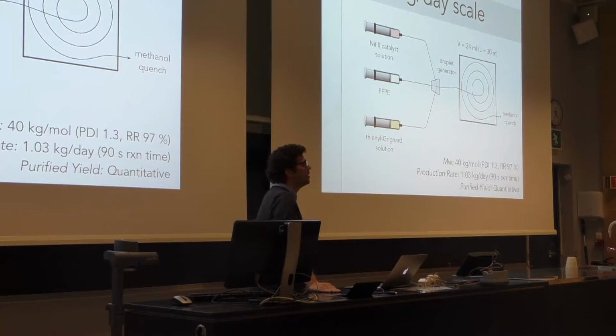So I'm always curious about the logistics of these setups. On this 1 kilogram scale, obviously you're not using a syringe pump, right? We're using reciprocating pumps, so yeah. So you have a reservoir of... Yes, we have a big tank that we're drawing everything up from. Okay. Cool.